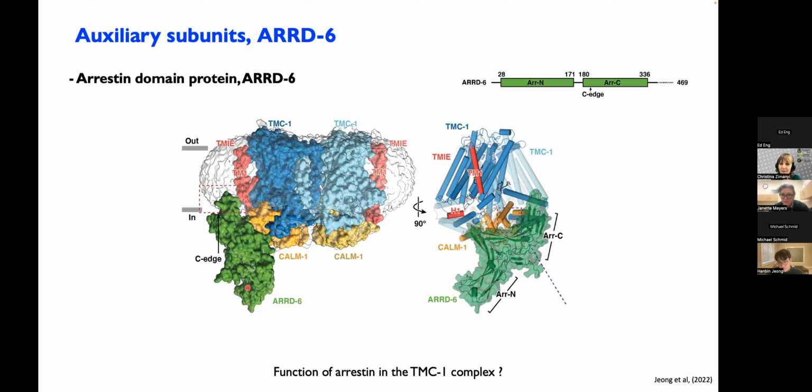Well, let's see the next one. We have a question. Just to clarify why you chose amylamine, was there something else you considered before? Or is that one of the first things you tried? Yeah, it is the first thing I tried after the air glow discharge did not work for me.